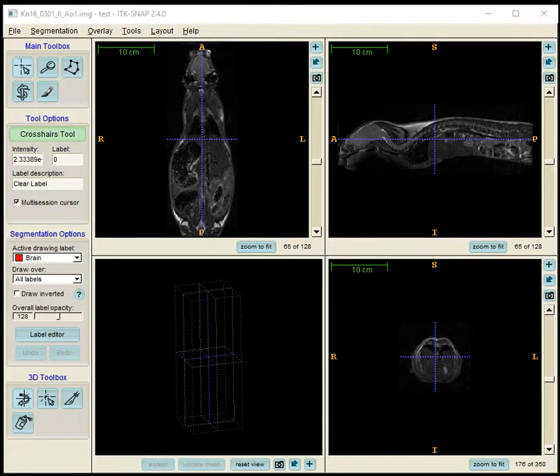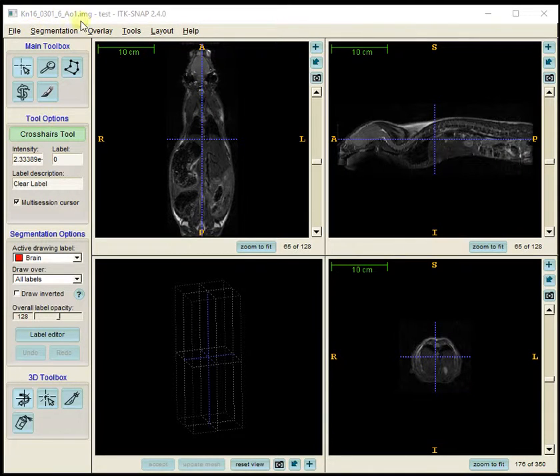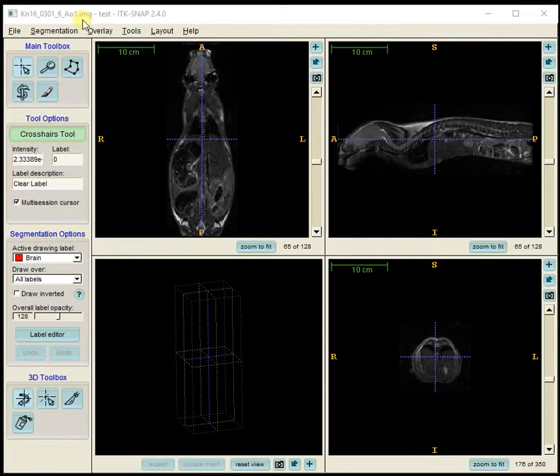The file name for the data is shown in the upper left-hand corner — that's an Analyze file format. I had to first save the 2dseq files in Analyze format because the 2dseq files were saved as 32-bit format and couldn't be brought into ITK-SNAP. I did the conversion from 2dseq to Analyze using ImageJ, then opened the Analyze images in ITK-SNAP.